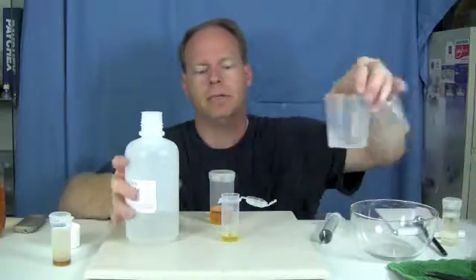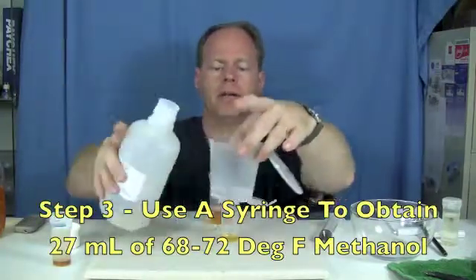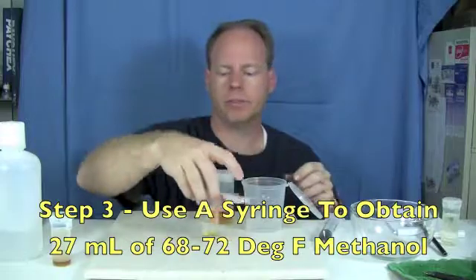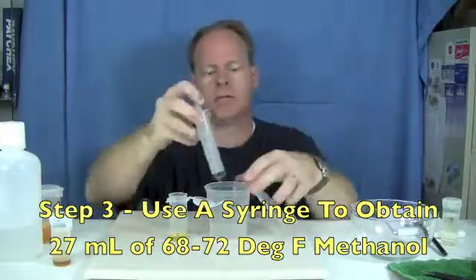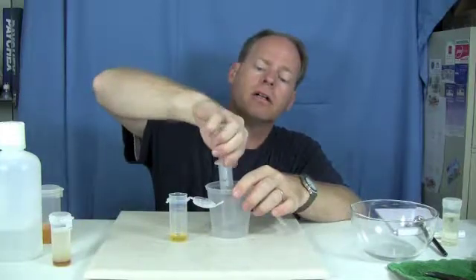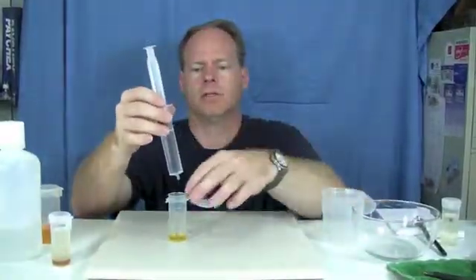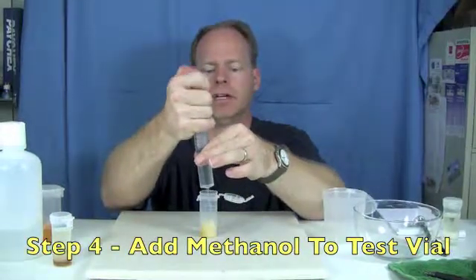The next step is to get some methanol ready — I have some pre-measured out here. It's also important that your methanol be at that temperature as well. I'm going to measure out 27 milliliters of methanol, and now what we do is we simply put this into the vial.